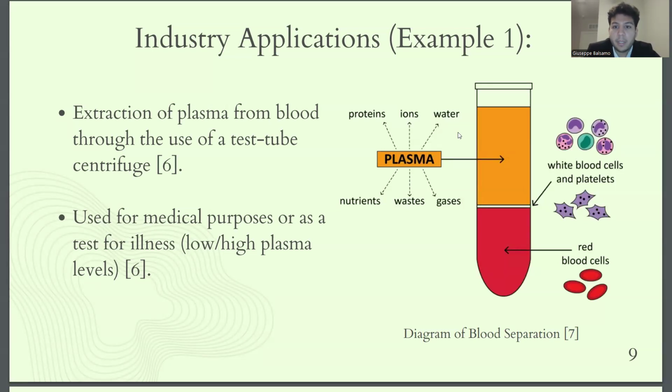So my first example has to do with one of the most common applications of centrifuges within the biopharmaceutical field. This is the removal of plasma from the red blood cells in the blood.